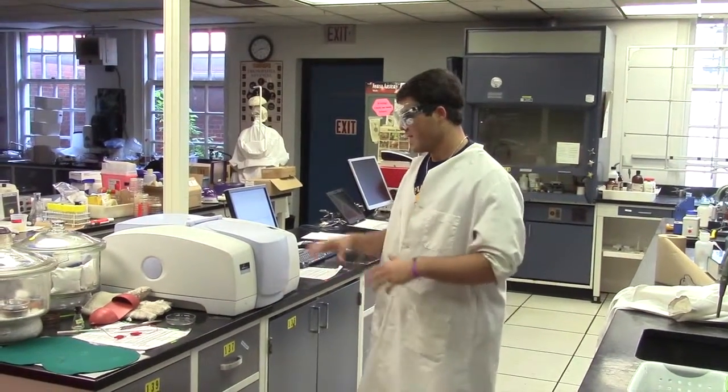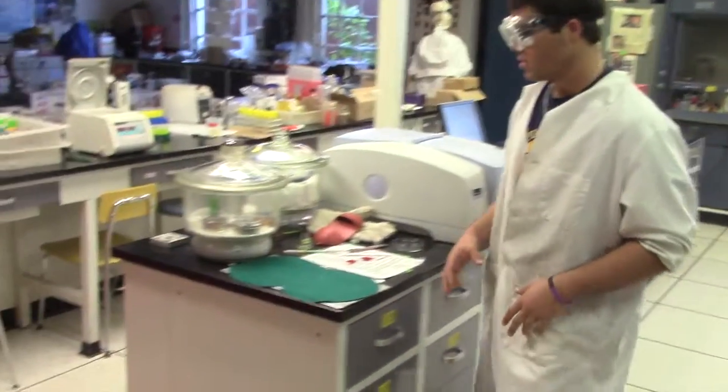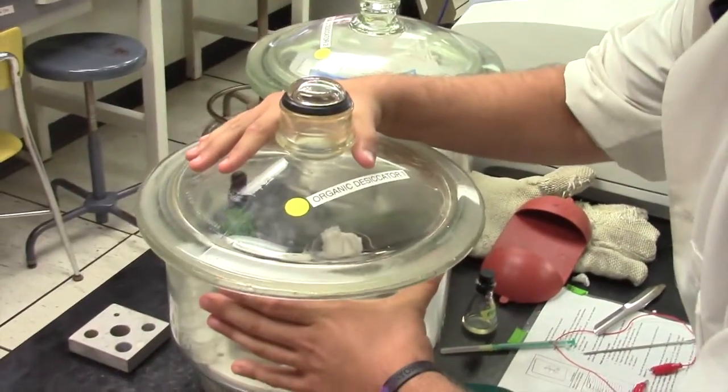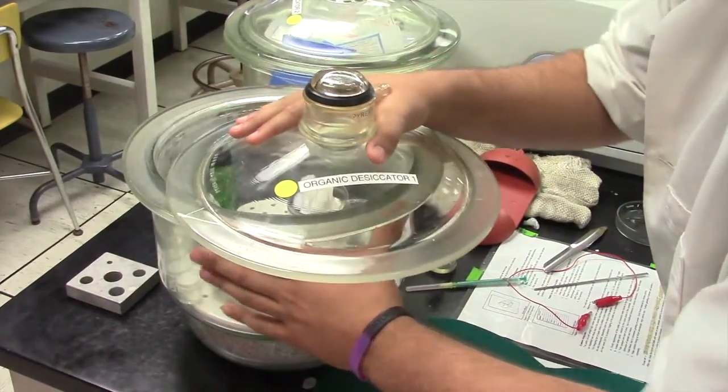So, salt plate preparation. In the beginning of the year, a lot of the experiments that we did ended with the product being in liquid form, and to run that through the IR, you have to use a salt plate. And the salt plates are in the desiccators. Be careful when you open the desiccator.